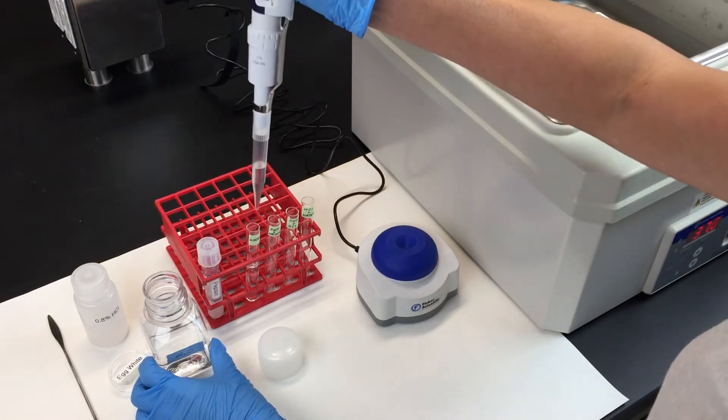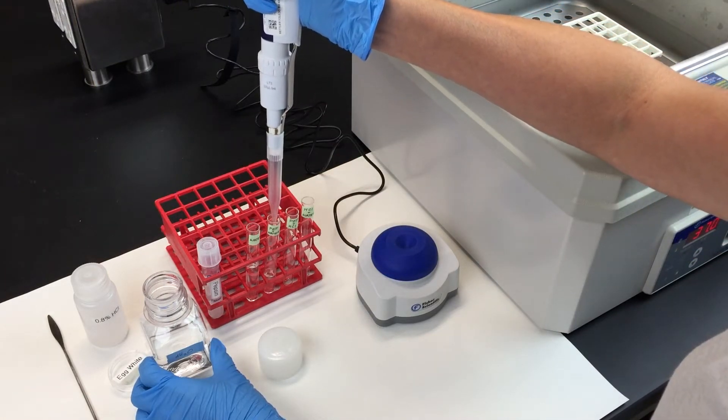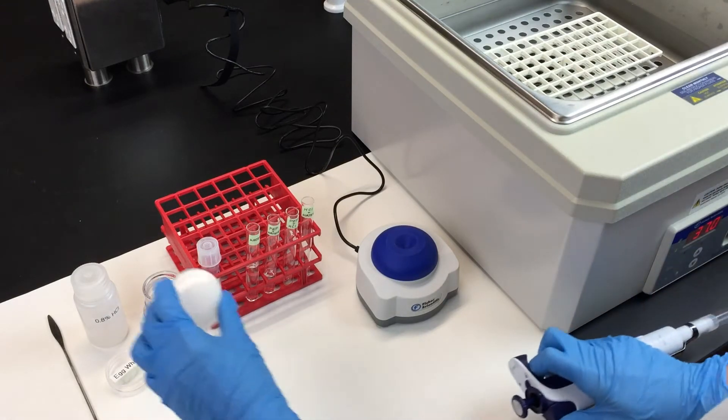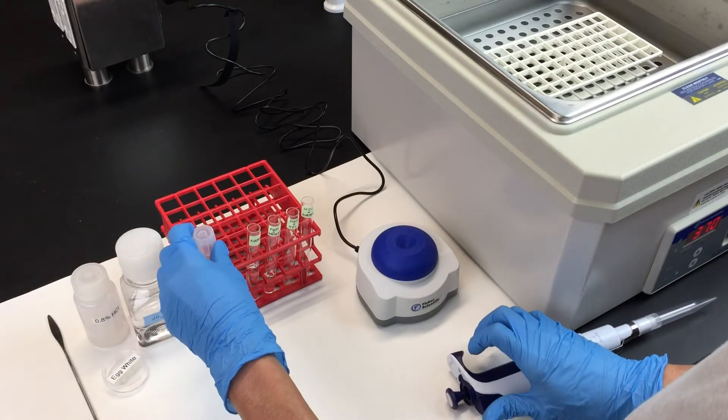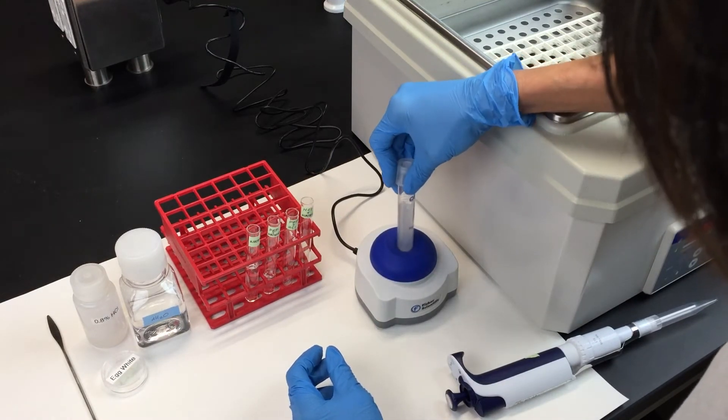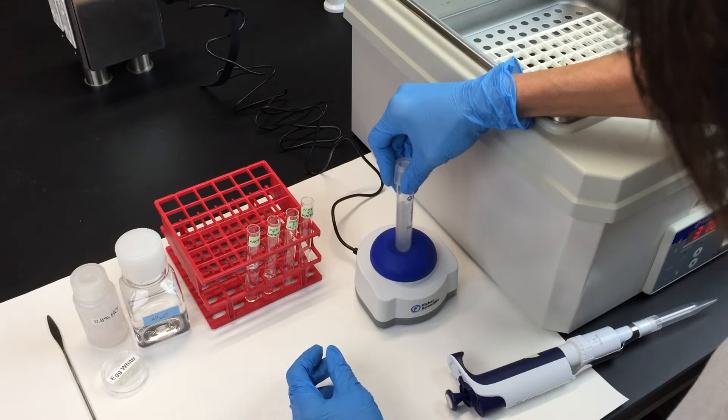The second test tube will have 2.5 milliliters of water and 2.5 milliliters of pepsin. Make sure you mix the pepsin well before you add it, because it will settle to the bottom of the test tube over time.